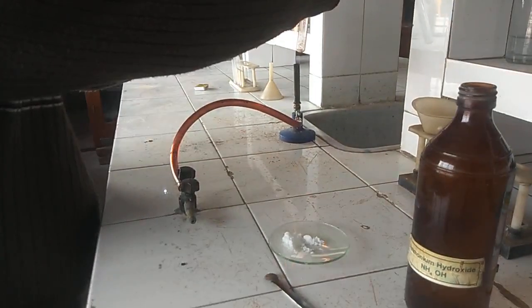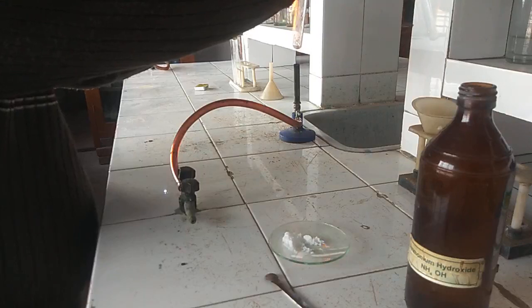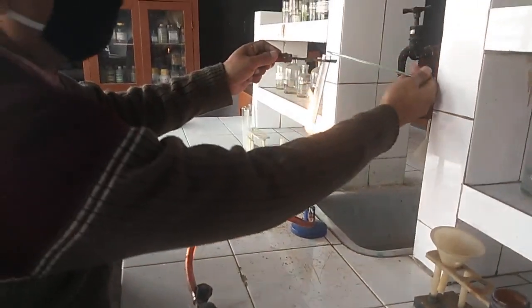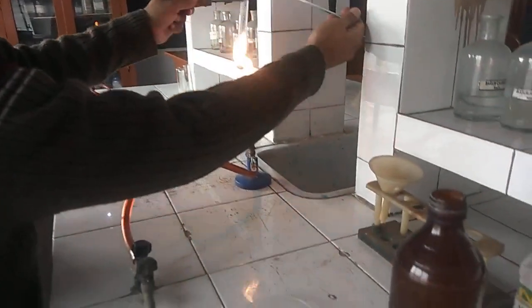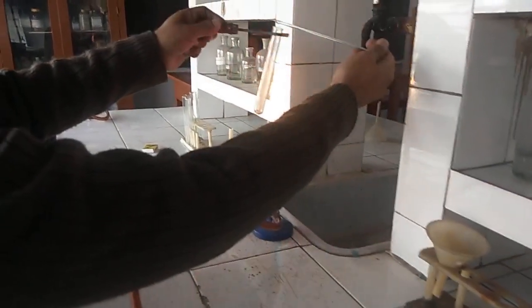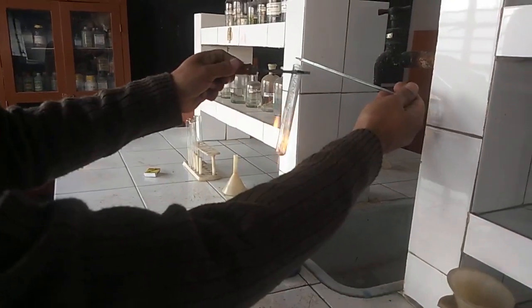On heating, HCl gas will evolve, and how will we check the presence of this HCl gas? We will dip a glass rod in ammonium hydroxide solution and put this glass rod over the mouth of the test tube.